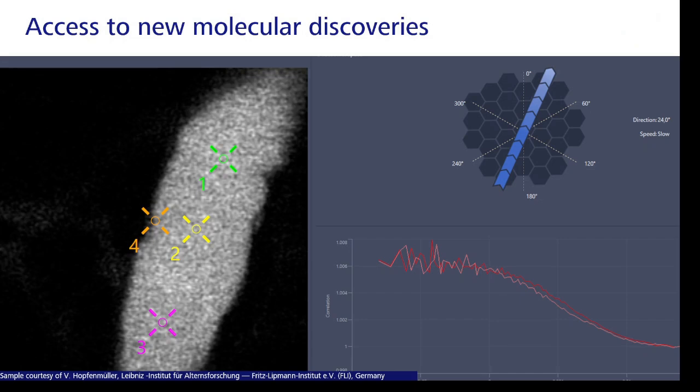But you don't need to worry about all this calculation and flow angles. In the interface of the dynamic profiler, you can directly get the result of the flow direction and flow speed.